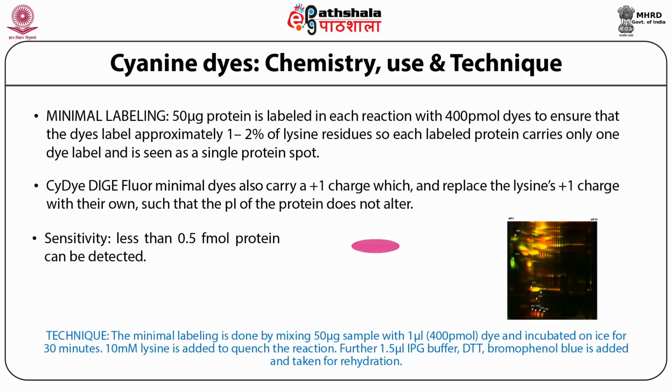The dyes are all charge matched and molecular mass matched to prevent alteration of the isoelectric point and to minimize the interference of the dye either to the isoelectric focusing technique or the SDS-PAGE electrophoresis. The technique itself has an advantage of detecting proteins in the femtomolar range.